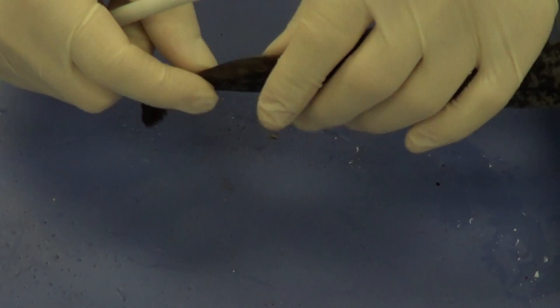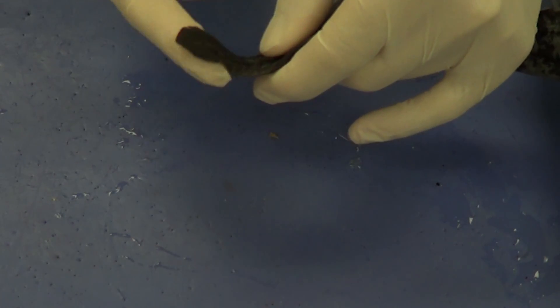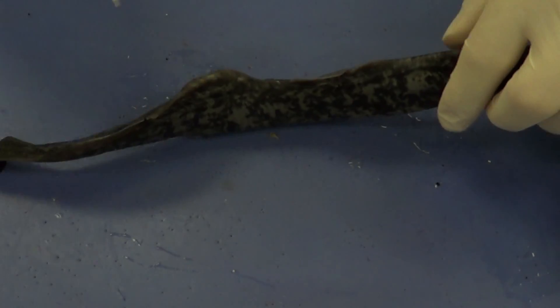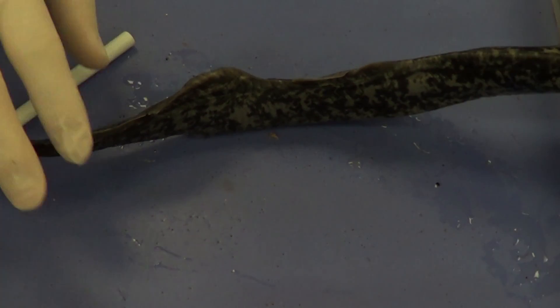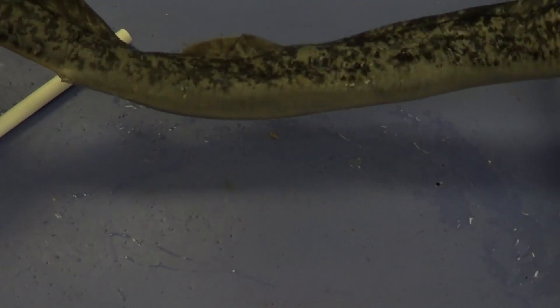At the very posterior end, we can see the caudal fin, which is used for propulsion to push the lamprey forward. The anterior dorsal fin and the posterior dorsal fin are used mainly to keep the lamprey upright, so it doesn't tip over sideways in the water.